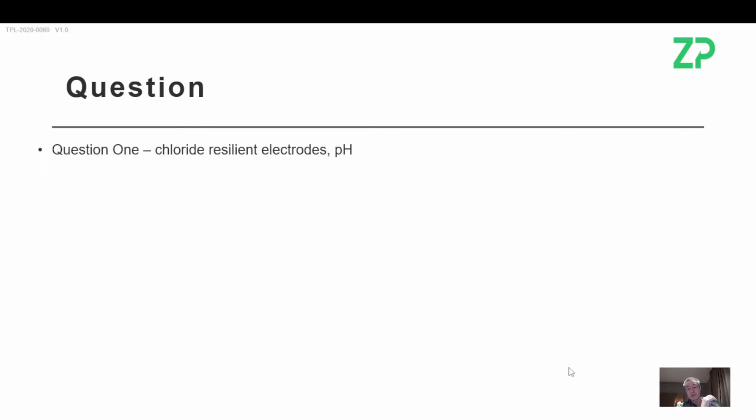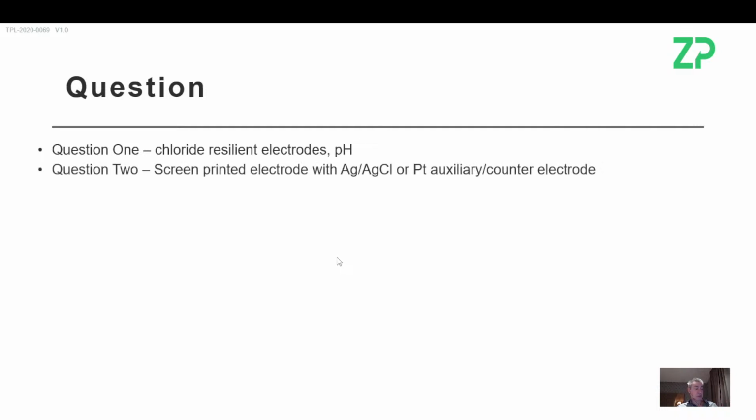So question number one today, if you see your question, then you'll know that I'll be answering it at some point in this webinar today. Somebody wants to know the difference between our pH sensors. Some have chloride resilient electrodes, some don't. I'll discuss that very quickly. Screen printed electrodes, whether to use a silver chloride or platinum auxiliary counter electrode. Quick answer is I would absolutely recommend the silver chloride, and I'll give you a bit more detail on that.